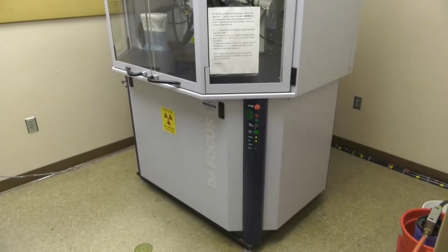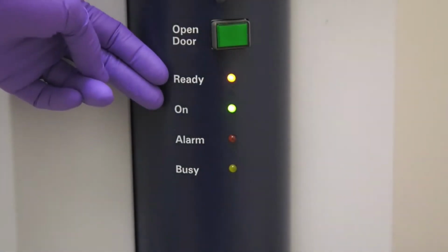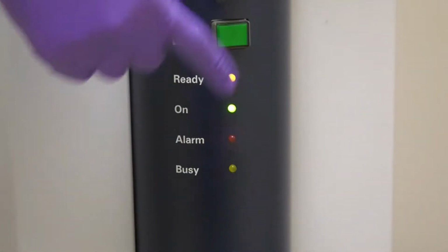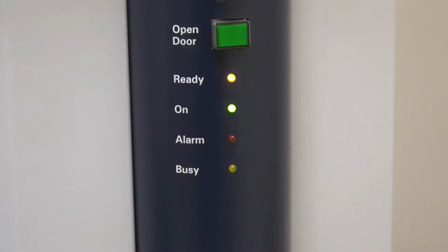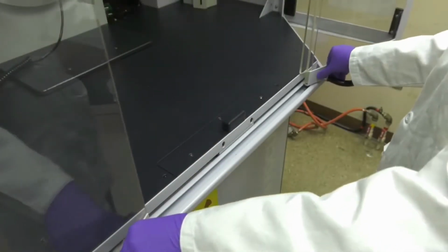Upon entering the XRD room, the user should take notice of the operational lights on the side of the instrument. The ready and on lights should be illuminated, while the alarm and busy lights should be off. To unlock the doors, the user presses the open door button. The alarm light will blink while the doors remain unlocked. To open the doors, the user pulls the two black handles towards themselves simultaneously, then gently slides the doors apart by the metal fixtures.